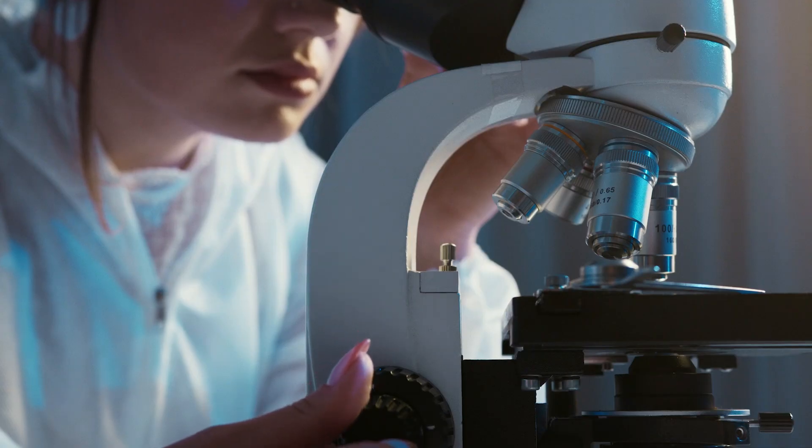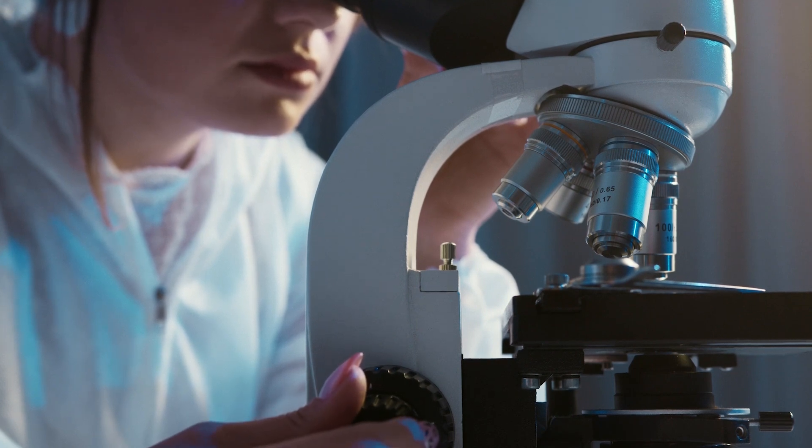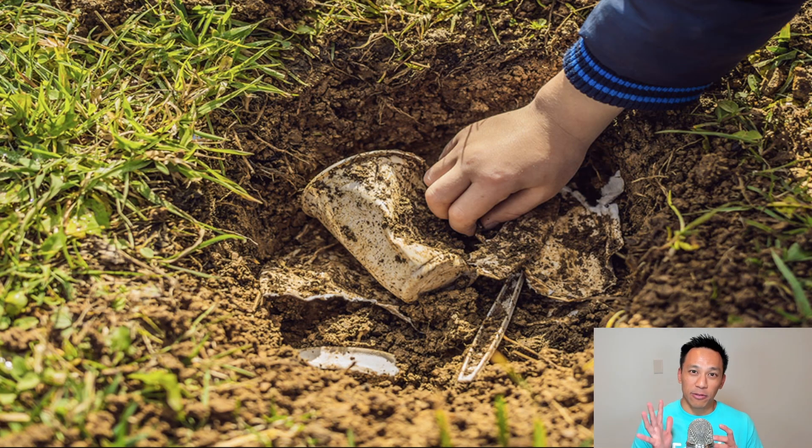How long does it take for biodegradable disposable gloves to break down? According to our tests, in 45 days, you can expect a biodegradation rate of around 5%. In 90 days, you can expect a biodegradation rate of 10%.